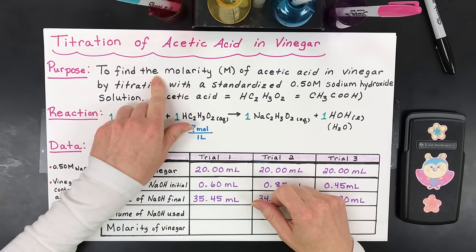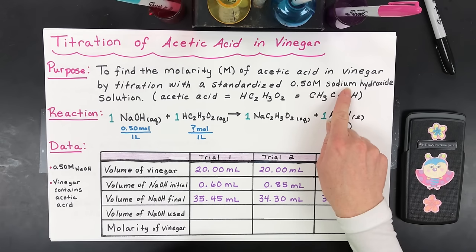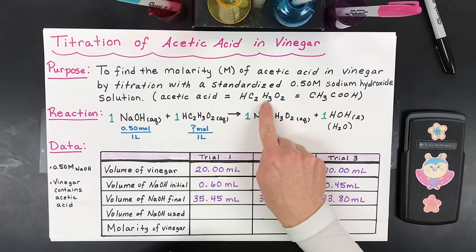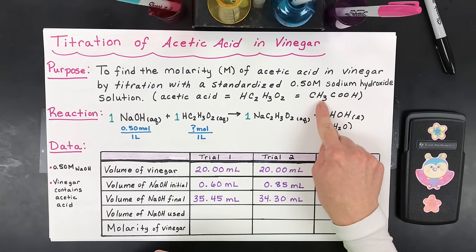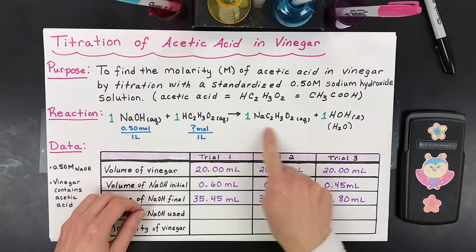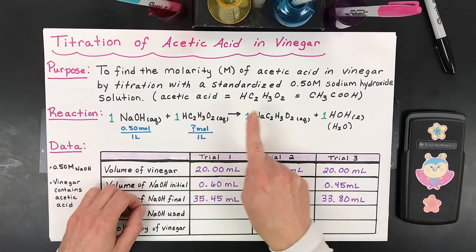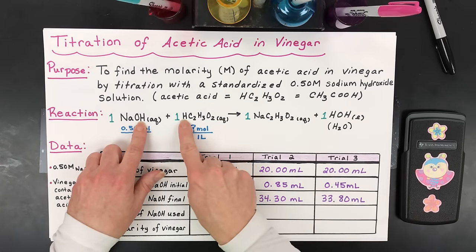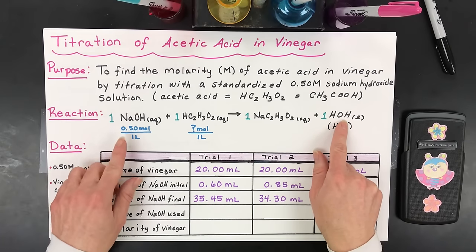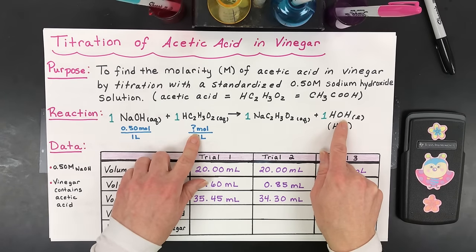What I did was I tried to find the molarity of acetic acid in vinegar by using that standardized 0.50 molar sodium hydroxide solution. Acetic acid can be written as HC2H3O2, that's the acetate ion right there, or you could write it as an organic acid as CH3COOH. Next, this is the balanced equation showing that I reacted sodium hydroxide in solution with acetic acid in solution, that's the vinegar, and I produce sodium acetate solution and water molecules as liquid. I like to write water as HOH because you can see these hydroxides reacting with the hydrogens to produce that as a product. I again knew my molarity of my standardized sodium hydroxide solution, and the goal is to find the molarity of acetic acid in vinegar.